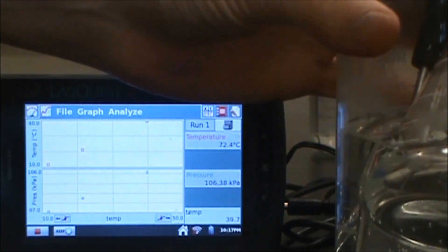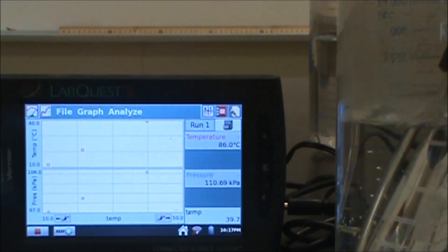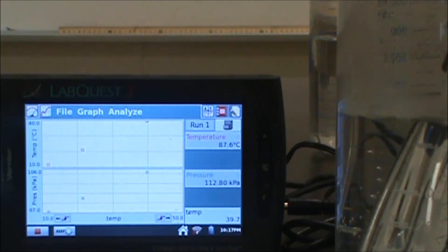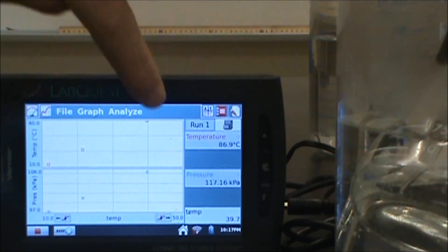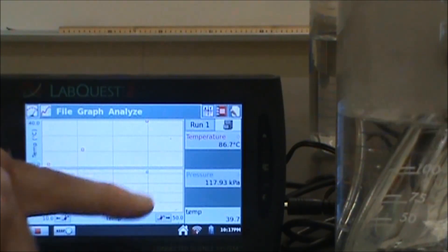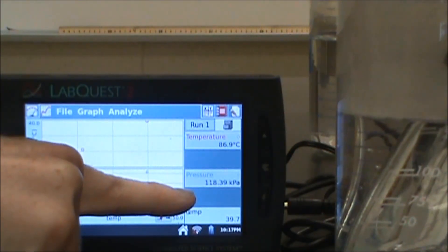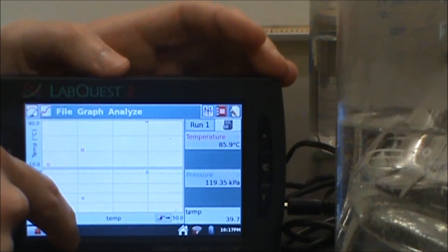I want the gas to get to a point where I'm pretty confident that the gas itself is the same temperature as the reading on this particular thing. So now I'm looking at 80 something degrees. You can read the temperature right here. My pressure has changed as well. I want to wait. Really a good way to do this would be to track this pressure and see when the pressure stops changing. But for video purposes, I'm not going to sit here forever. We're going to call this a day at some point so that you don't lose your attention span.